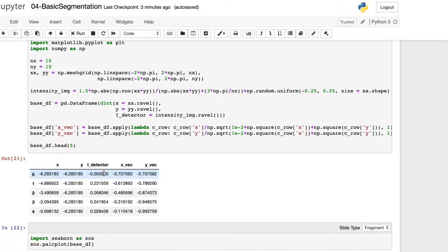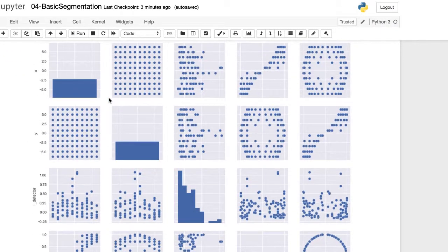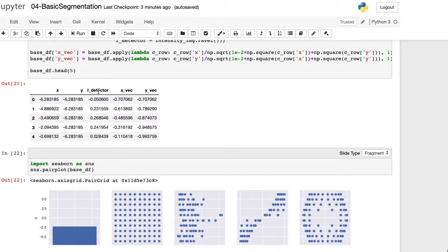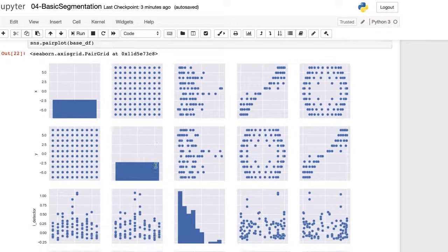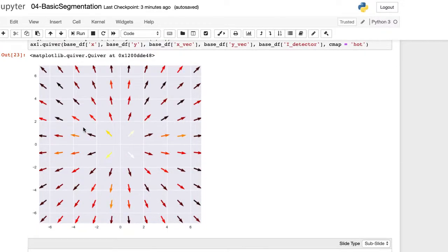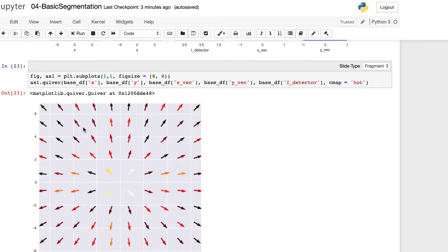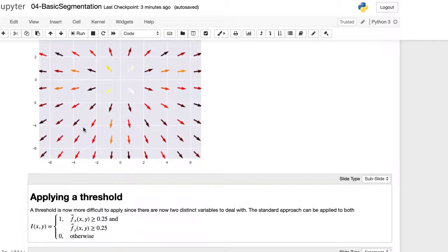the exact same way. If we have an image like this where at each point we have not just an intensity value, but also a vector indicating where that intensity is going, which can be visualized like this, so that you have a color associated with each point and a vector, you can also start to apply segmentations the same way as you would to another image.